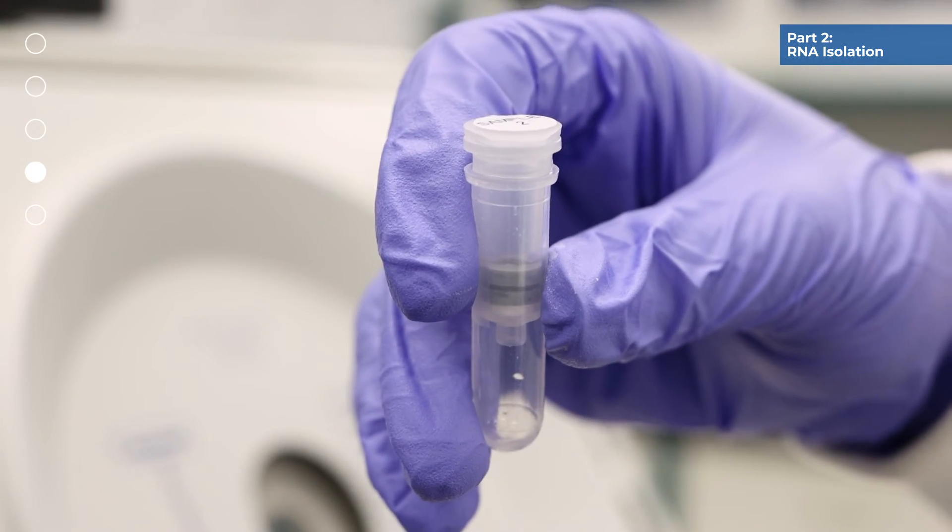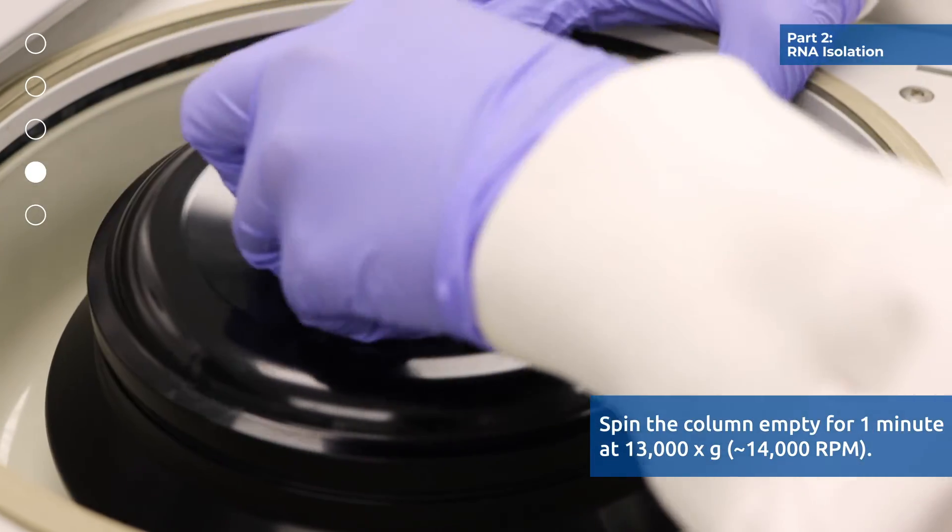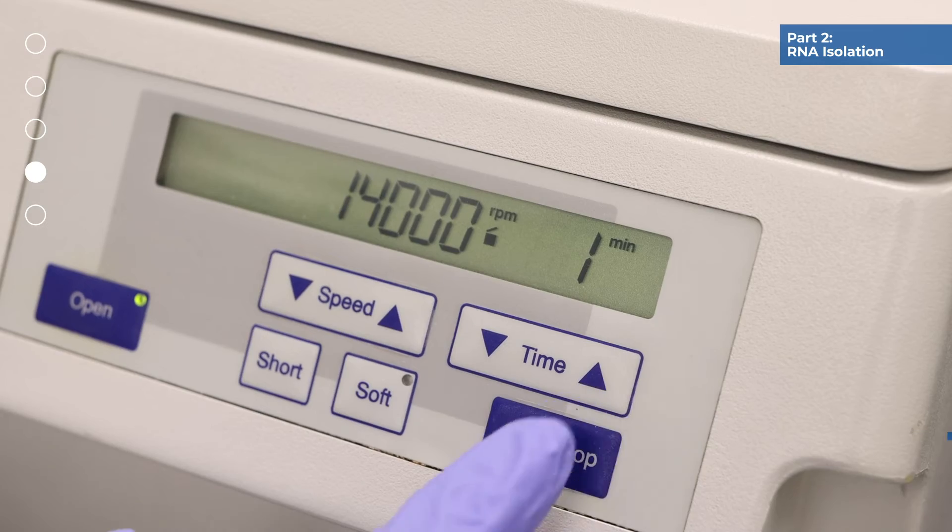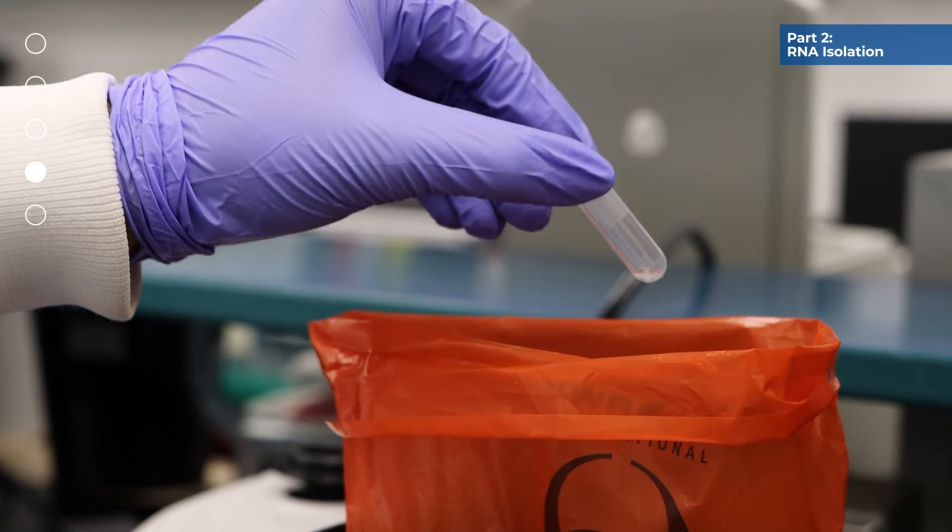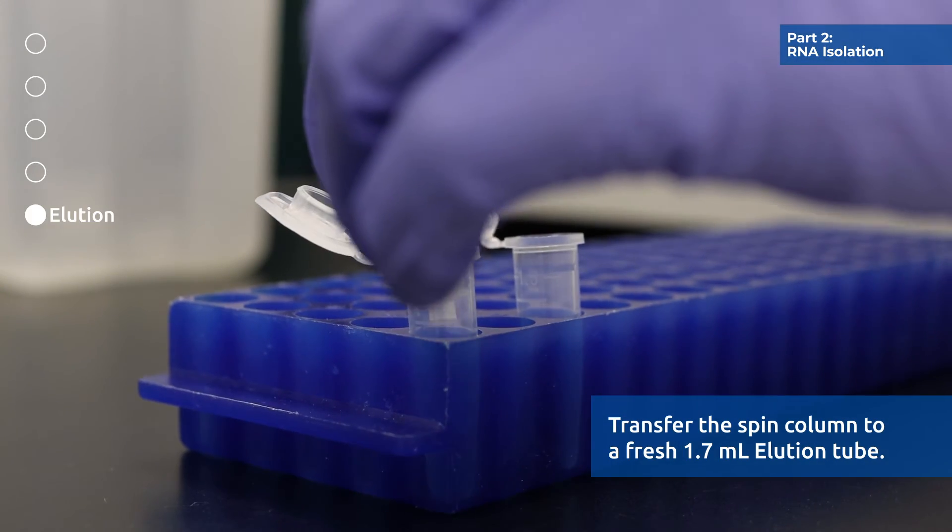Repeat step 6 one more time for a total of 2 washes. Spin the column empty for 1 minute at 13000 g or 14000 rpm. Discard the collection tube. Transfer the spin column to a fresh 1.7 milliliter elution tube.